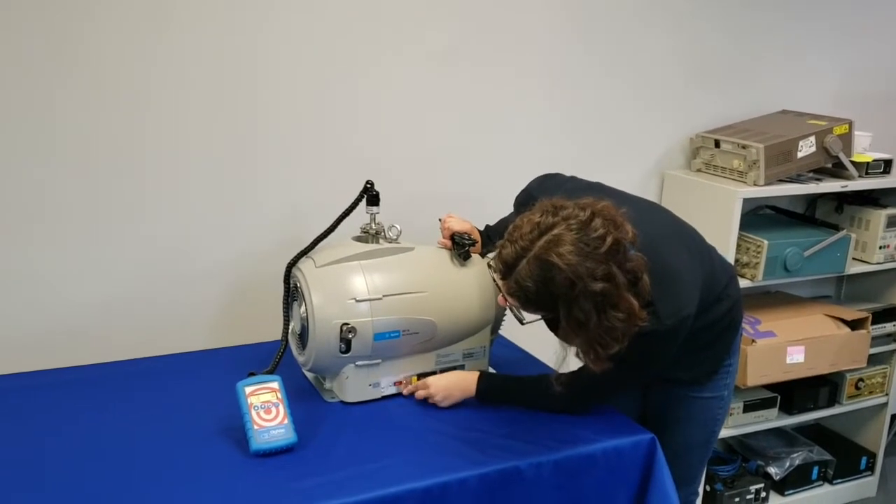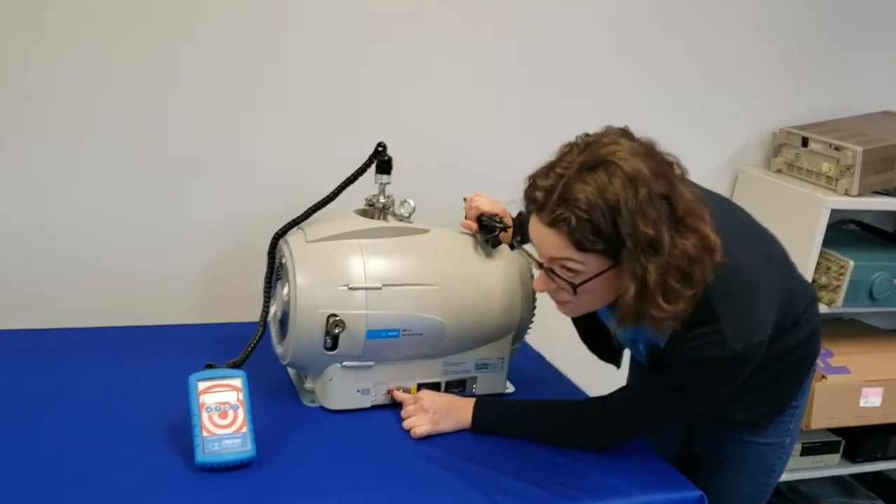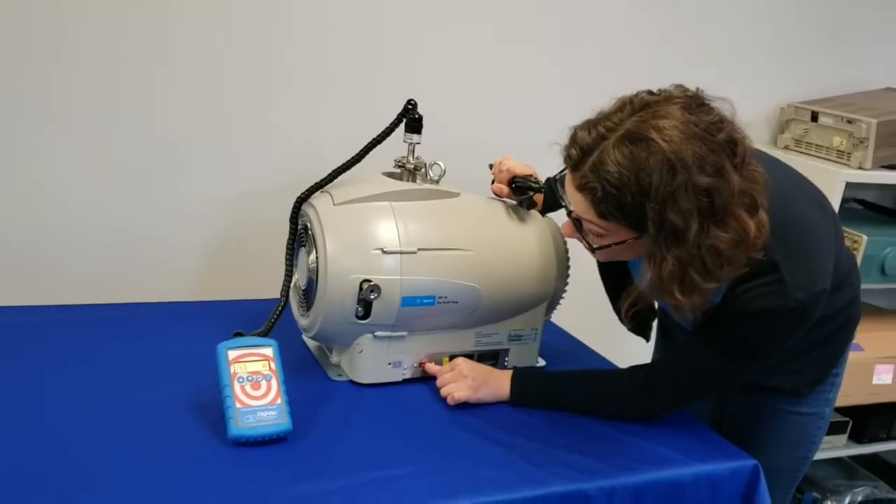Take a look at your voltage selector and make sure you've selected the correct voltage, remembering that the pump is set for 230 volts from the factory, but we'll be using 115.